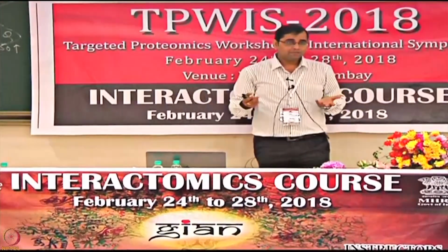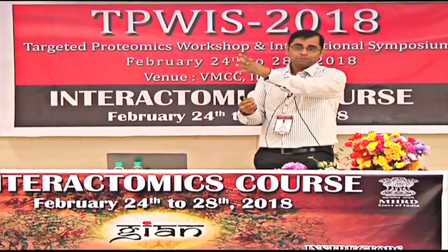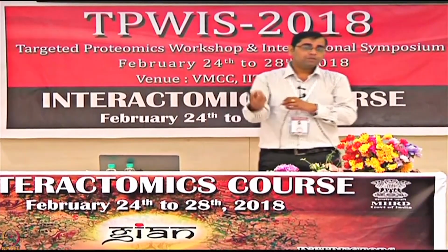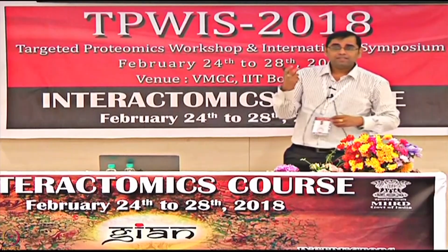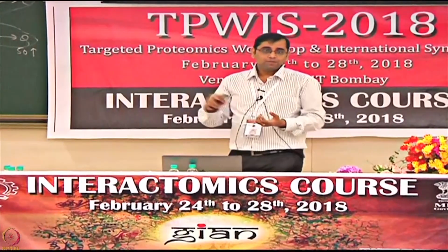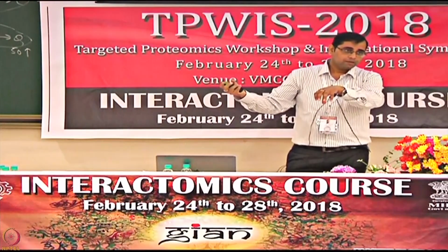What can be the actual power of the technology is that you have an unknown protein printed, and now you are passing a lot of compounds, and you can see whether they are binding or not, right? Then can I discover something new which is binding? But what is that new thing which is binding, which you have no control over, which you have no idea about? So eventually you want to identify that particular binding with the mass spec.